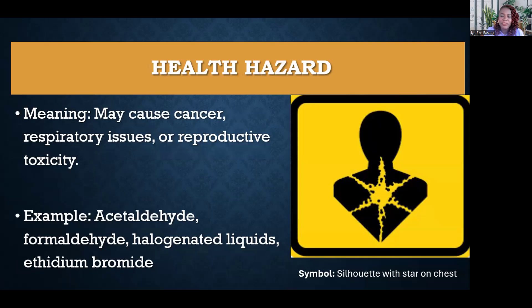Health hazards — you can see a picture of a person with something radiating across the chest area. This means that the substances there could cause cancer, respiratory issues, or reproductive issues. You don't want any of those, so keep away when you see this silhouette. Examples include acetaldehyde, formaldehyde, halogenated liquids, and ethidium bromide.